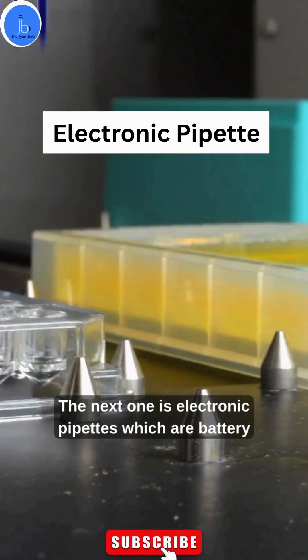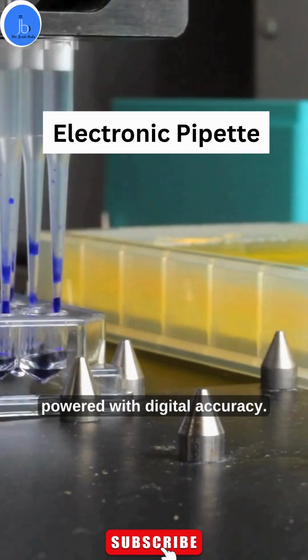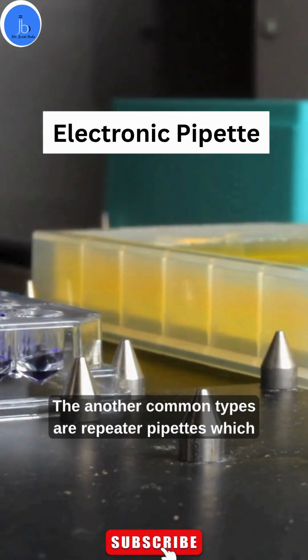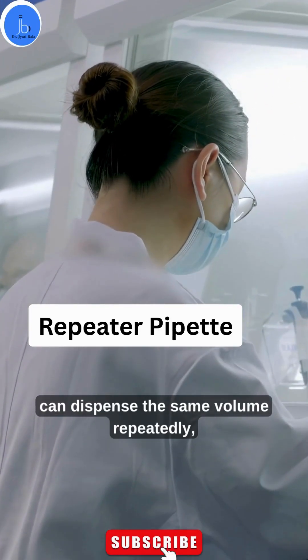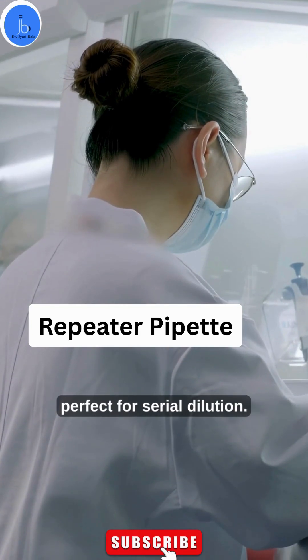Next is electronic pipettes, which are battery-powered with digital accuracy. Another common type is repeater pipettes, which dispense the same volume repeatedly, perfect for serial dilutions.